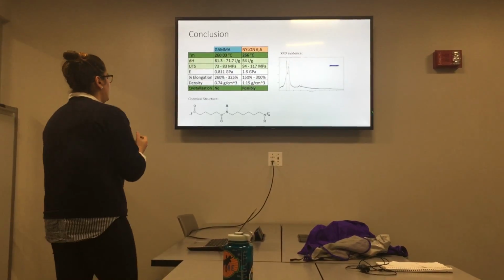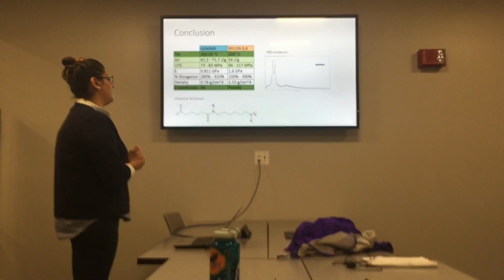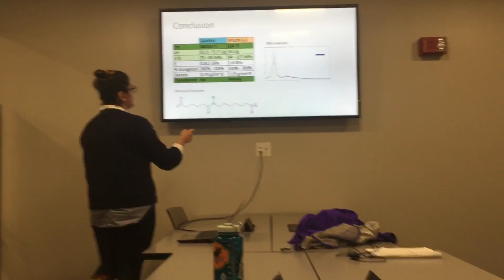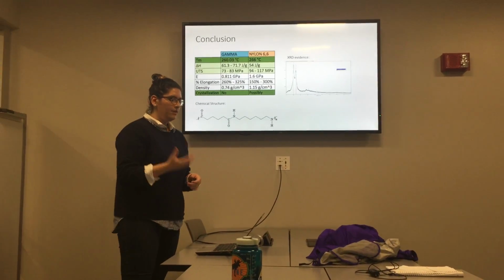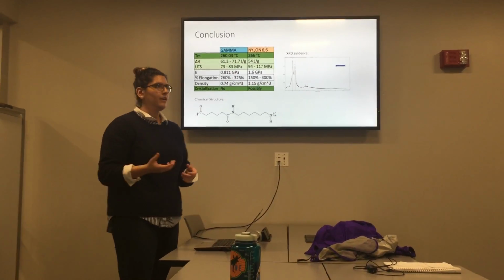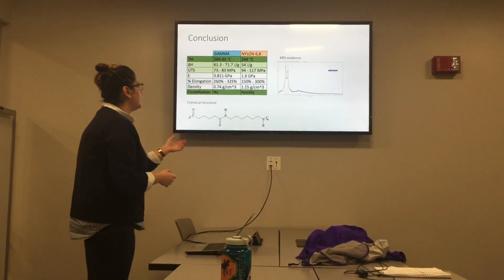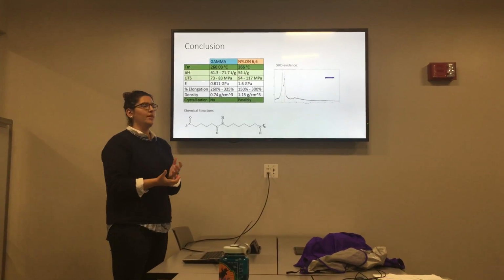With nylon 6,6, you can find crystallinity, but not always, so we don't think it's really detrimental that we didn't find it. If you look at the XRD plots, the PDF for nylon 10 alpha, I don't know what that is, but that's actually the only PDF that we have of nylon upstairs. If you look at that, the peaks line up really well, so we think if we could find one for nylon 6,6, it would be pretty close too.